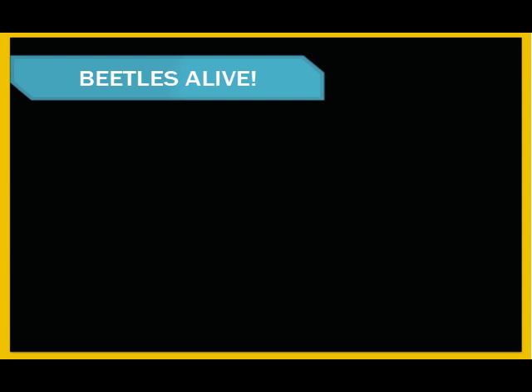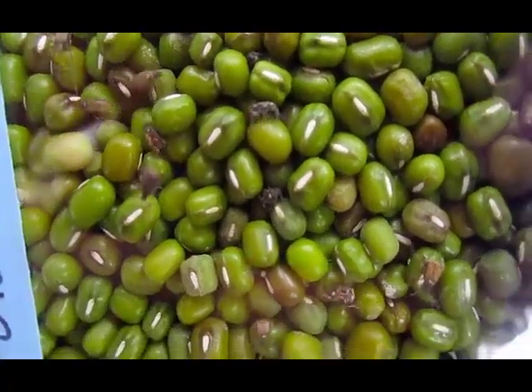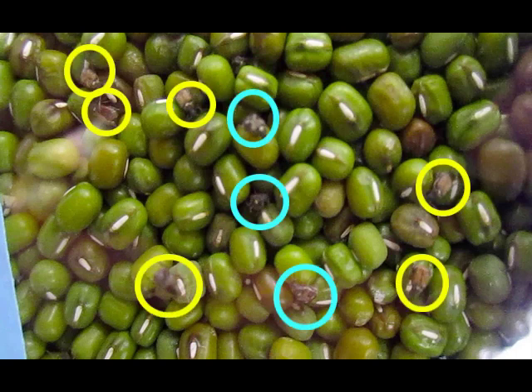And now for some moving pictures. As you'll be working with live beetles, it's important to understand how to identify your subjects of study as they're scuttling around. Hopefully, these exercises will help familiarize you with this process. Look at the video for a few seconds and count how many males and how many females you see. All of the beetles in the blue circles are females, and all of the beetles in the yellow circles are males. How close did you get? Let's try another plate, shall we?